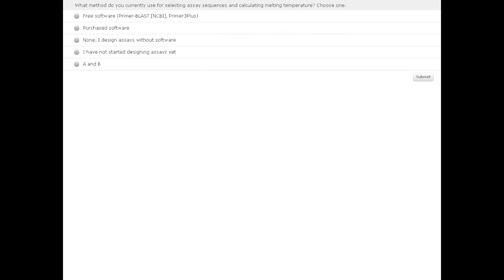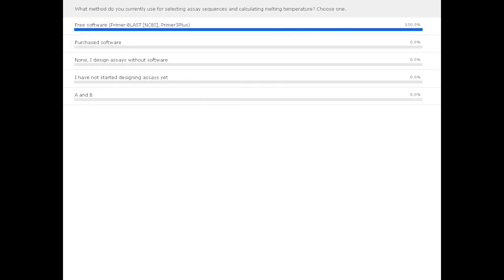Let's take another minute here to answer the following poll question. What method do you currently use for selecting assay sequences and calculating melting temperature? Choose one. Wow, that's incredible. It looks like 100% of you are using free software. That's great because we're going to talk a lot about that in the next few slides.